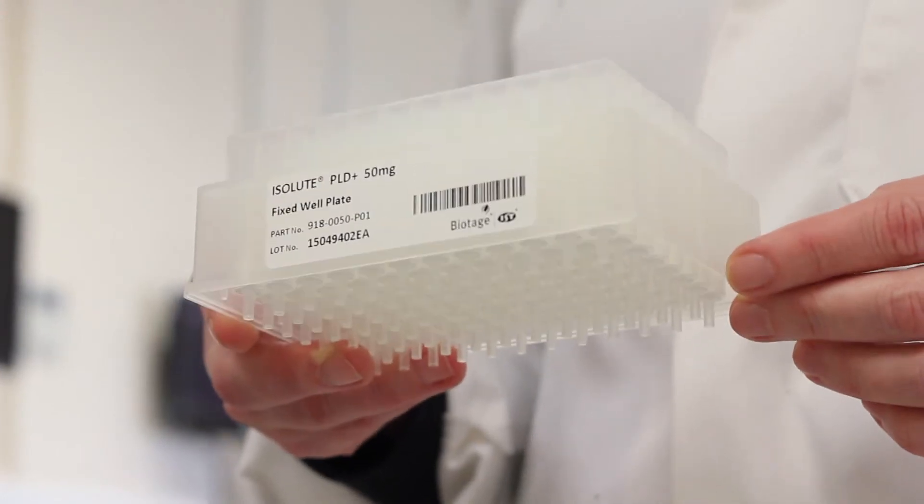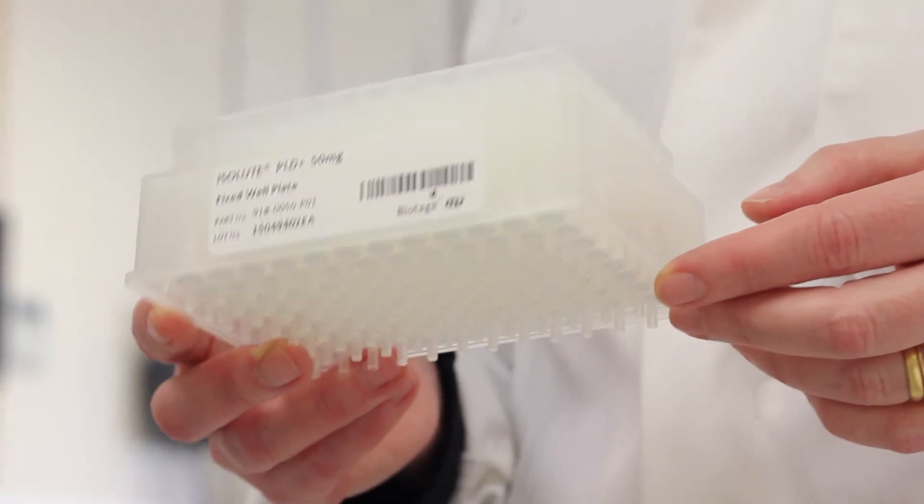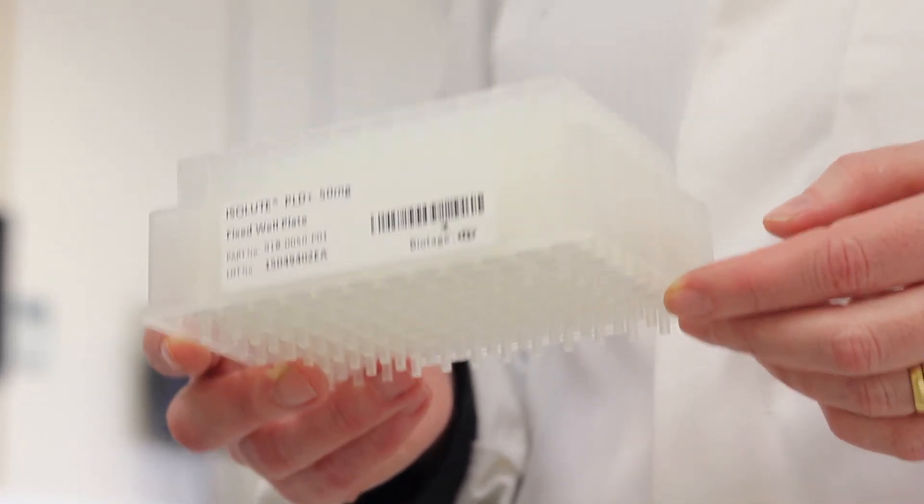Many scientists are familiar with the protein crash technique to remove proteins, and the Isolute PLD plate uses the same simple crash and filter procedure but has the added advantage of built-in phospholipid removal.